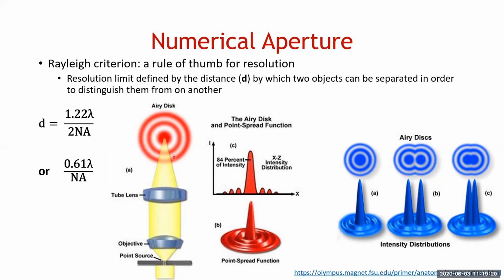So when we're talking about numerical aperture, it'll be easy to talk about the concept if you know what an airy disk is, or at least the concept of an airy disk, which simply describes the best focus spot of light you can make with a perfect lens. You can't really get a perfect spot because of the diffraction of light and various things. You get a pattern like this called the airy disk pattern. If you see it in a side view, you can see most of the intensity happens in what we call the zero order. That's about 84% of the intensity there.